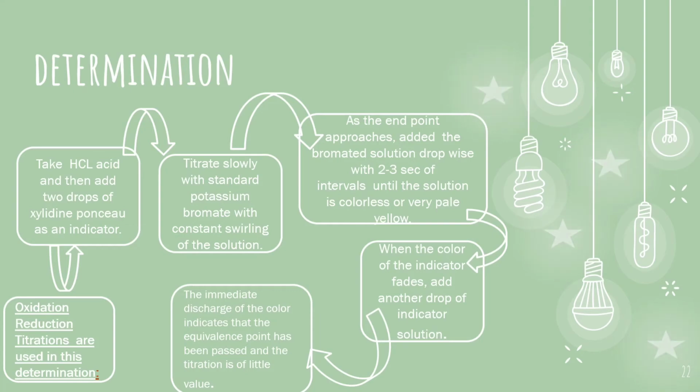When the color of the indicator fades, we add another drop of the indicator solution to it, and if the immediate discharge of the color occurs, it indicates that the equivalence point has been passed and the titration is of little value.